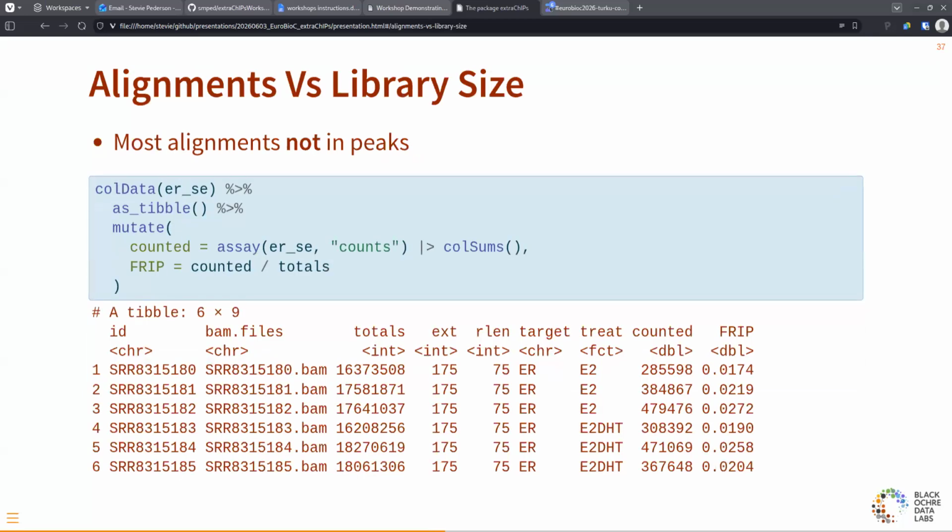Okay. You can quickly just have a look at this. This is a really hack version of the fraction of reads in peaks. You can formally actually calculate this using, I think, ChIP-QC. There's a lot of other packages that do this. This is a quick hack just to show you that within all these samples, we're down to about 2% of the counts actually coming from peaks compared to the total library size, and that's not unusual. Different ChIP targets will have different profiles. The noisier data sets will have different profiles. Generally, the guide says FRIP above 1%, and you're pretty good. There's an ENCODE guideline about that. I think I've linked that in the main page.